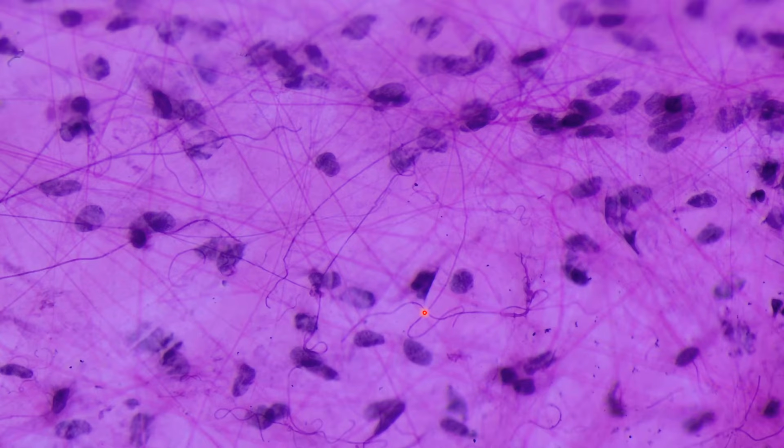Now we've seen this one before in a previous question. We have a bunch of these dark staining nuclei that are maintaining an extracellular matrix. We can assume that those nuclei are going to be fibroblasts. The extracellular matrix is primarily comprised of this fluid as well as fibers.